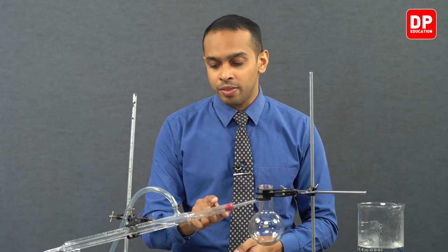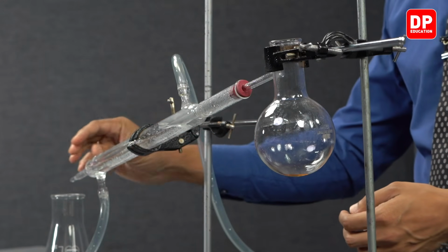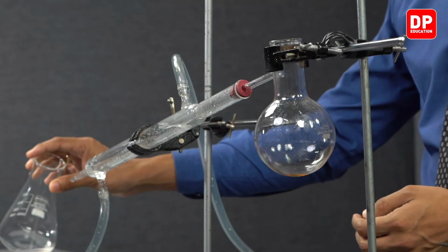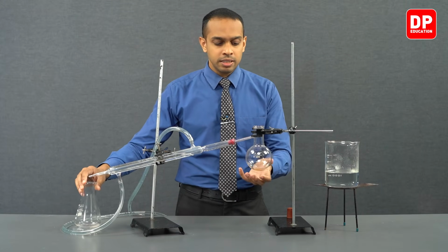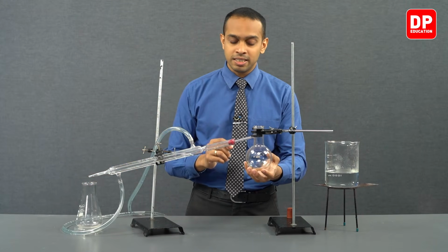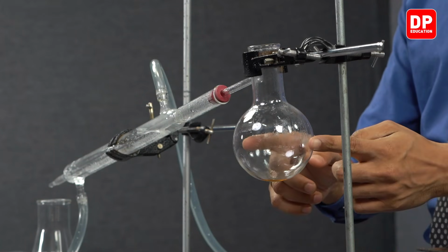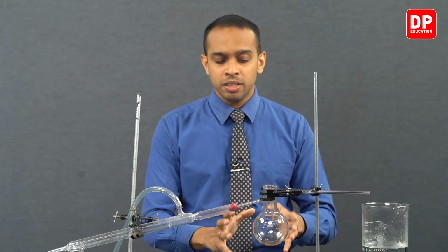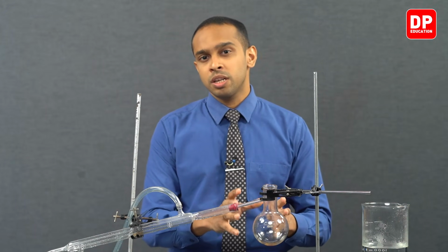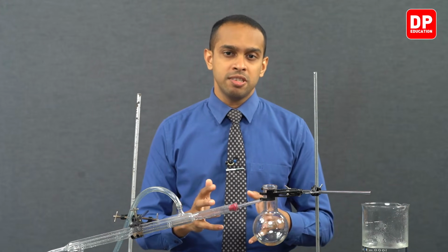And the evaporated diethyl ether was condensed with the use of a Liebig condenser and was collected into this Erlenmeyer flask. And in this distilling flask, we have our essential oil remaining, which happens to be eugenol. We have now observed how this essential oil was extracted from cinnamon leaves.